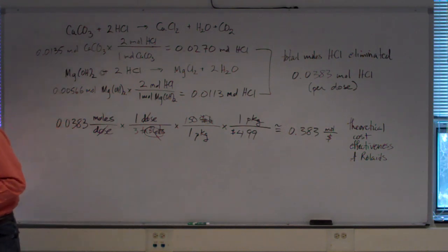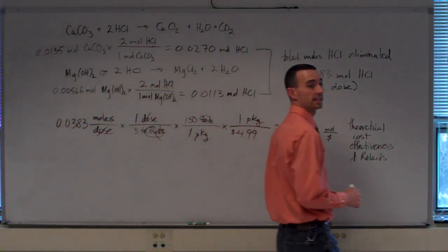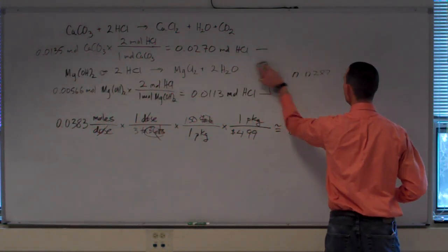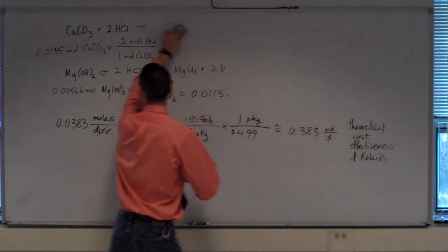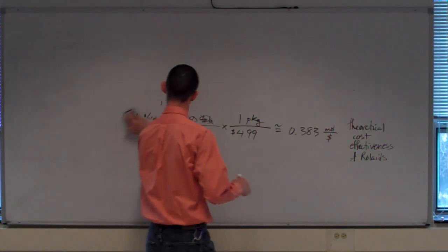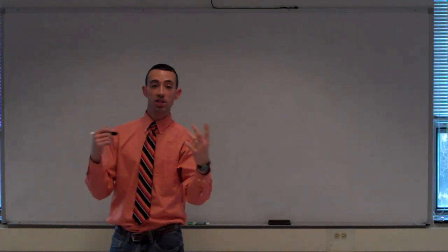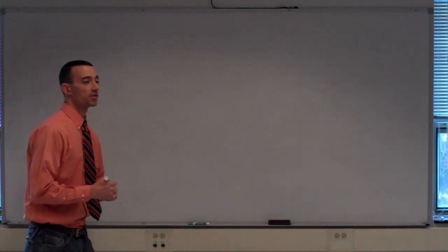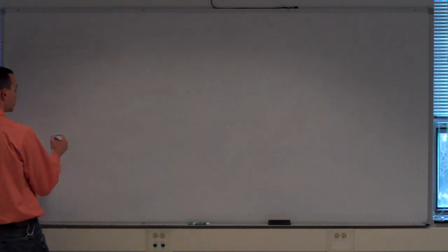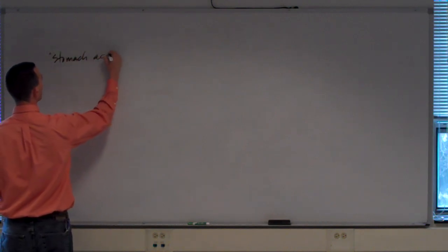Okay. Let's talk about how we're going to experimentally determine the neutralizing capacity of an antacid. We first need to establish the strength, or how much acid might be present. So we have a mock solution of stomach acid for you to work with in the lab.